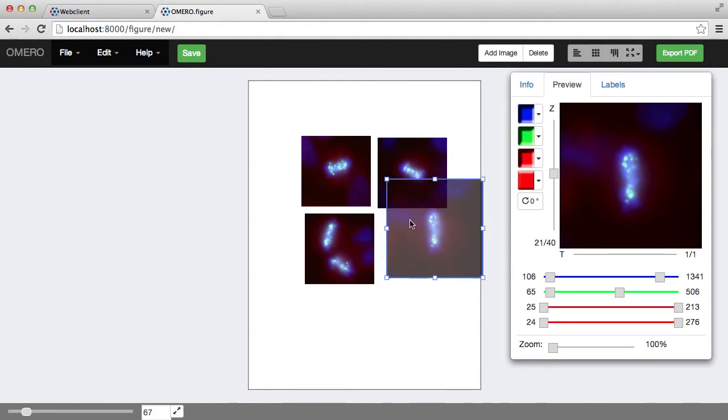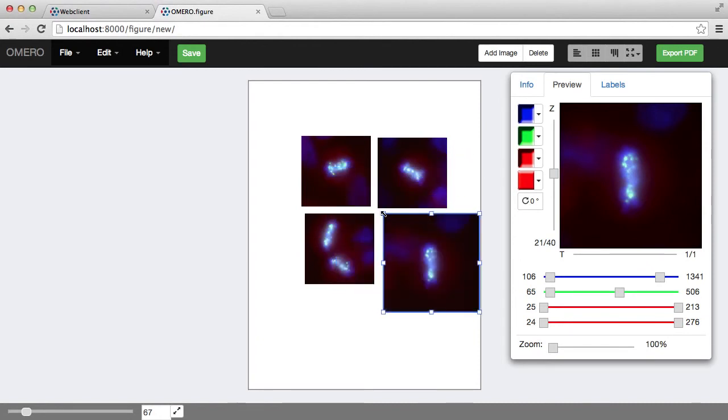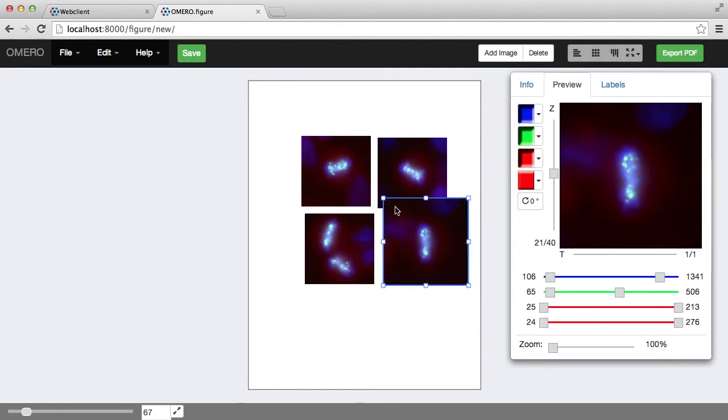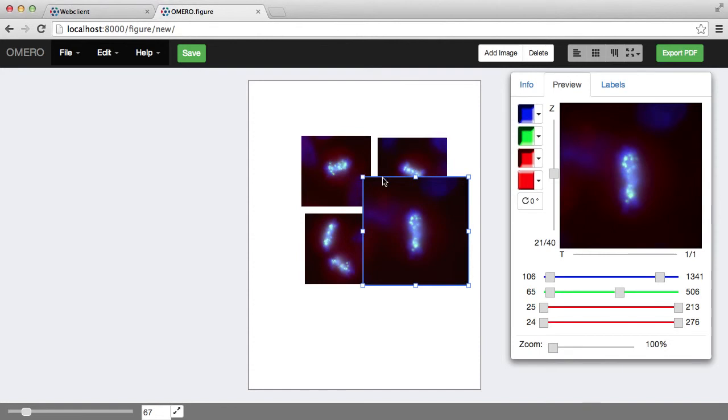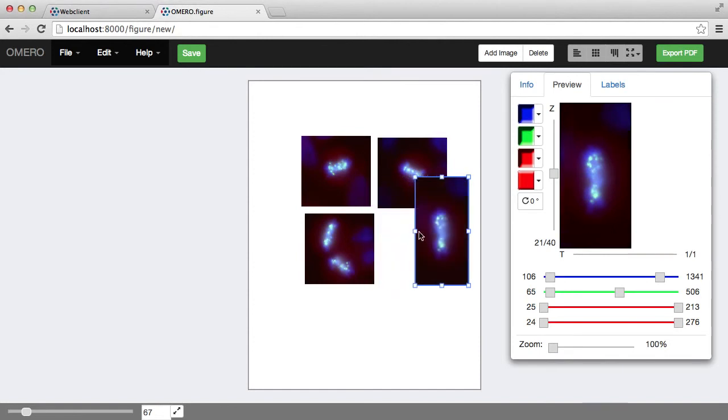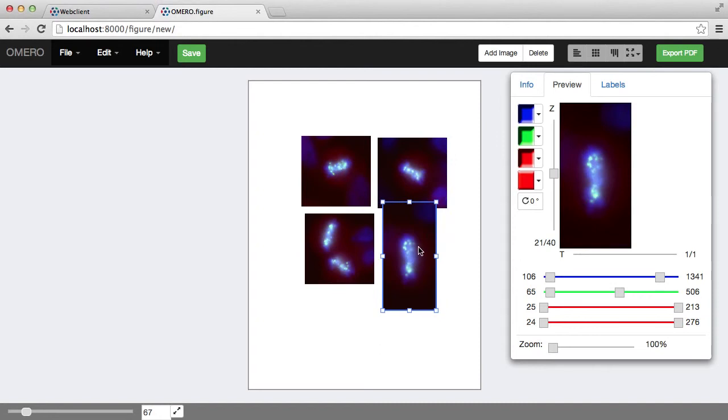So the images can be moved and resized. The aspect ratio will always stay the same if I drag by corners, or I can use the side ones there if I really want to squash an image.